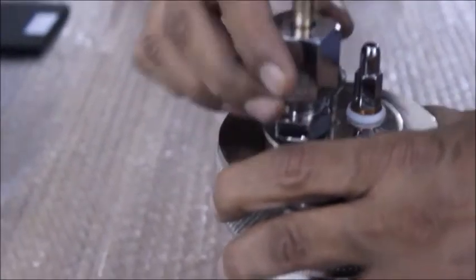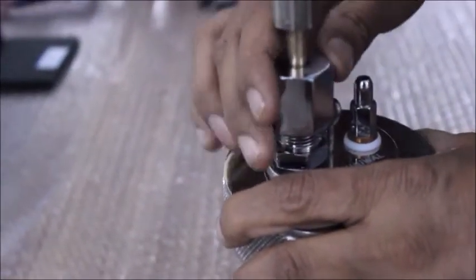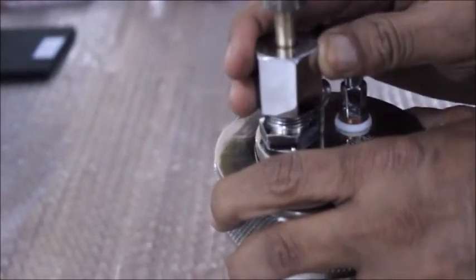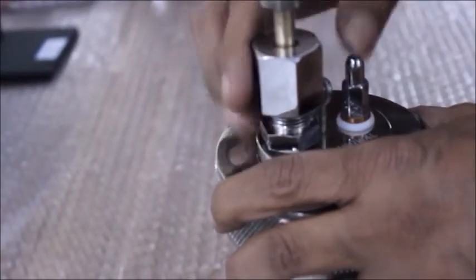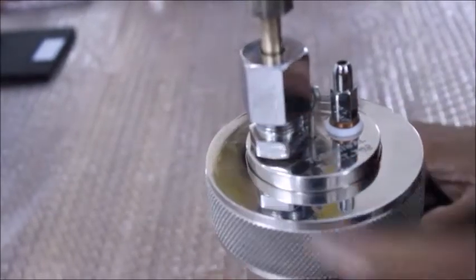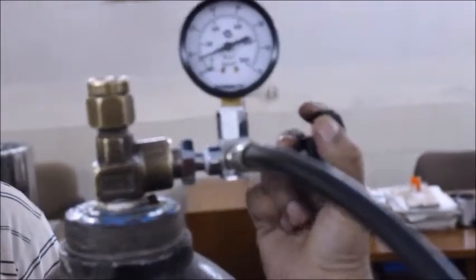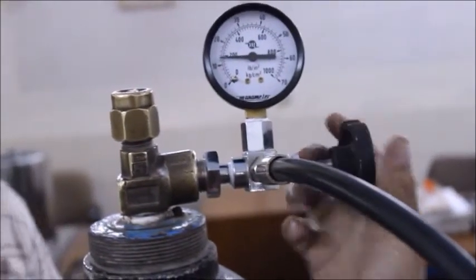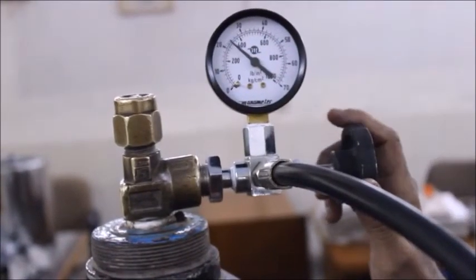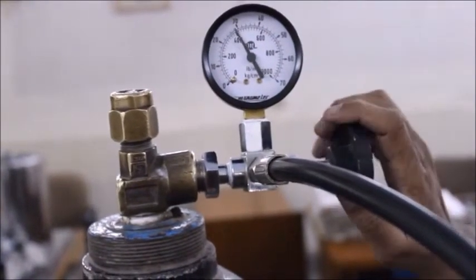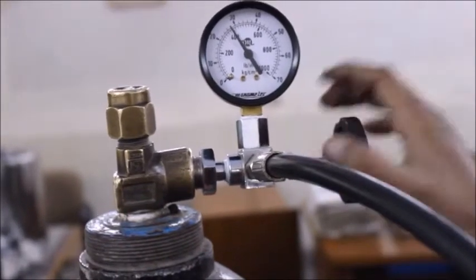You do not require a spanner for this. Loosen the black knob to release oxygen. When the dial hits 30, close the black knob to stop the flow of oxygen.